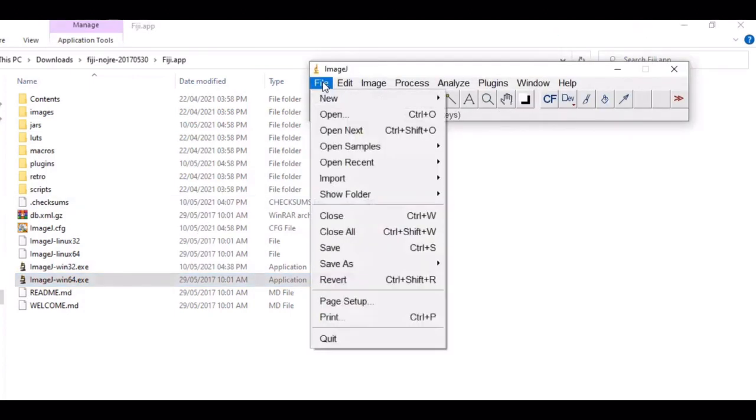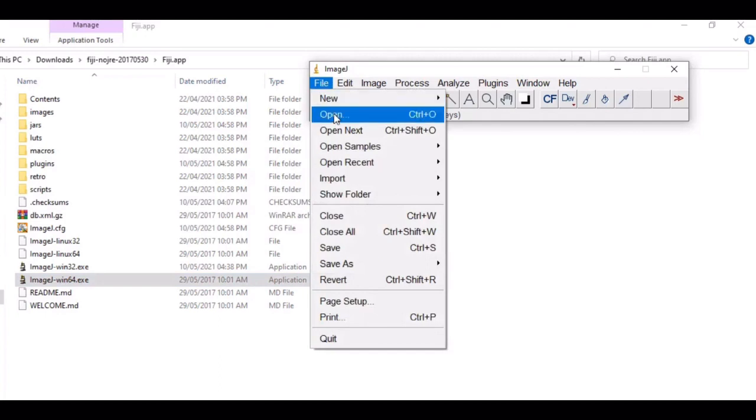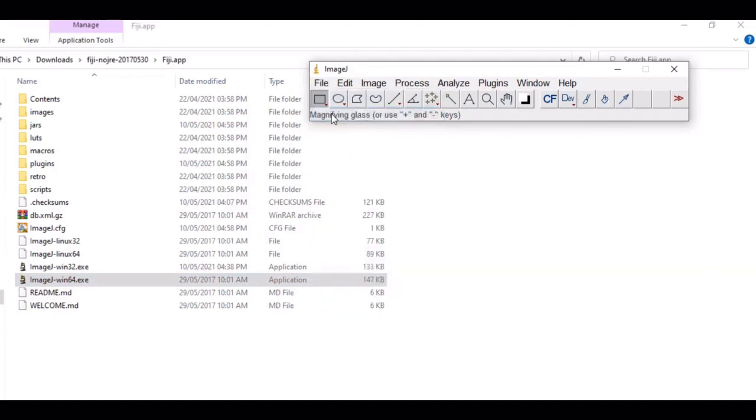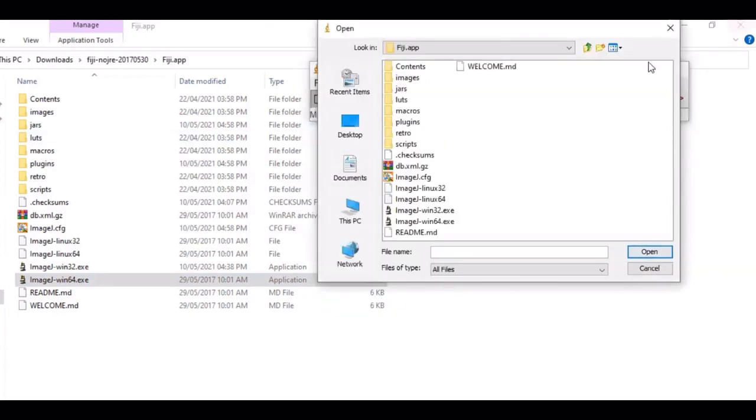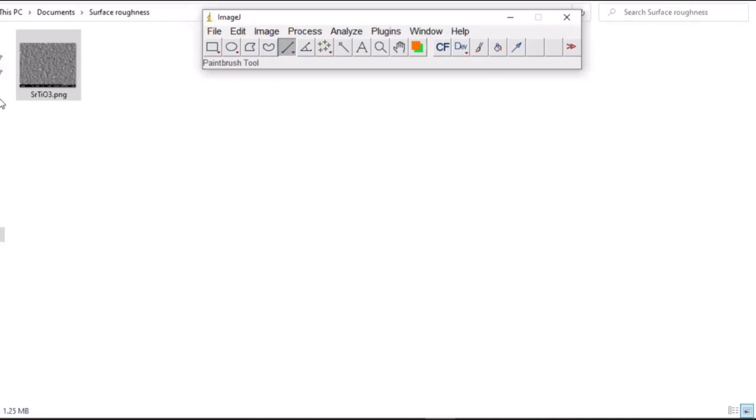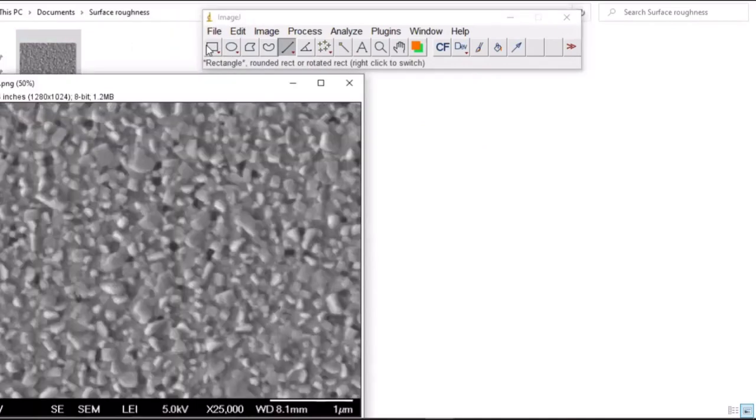Go to file and open. Search for the destination you saved your file or you can easily pick and drag.